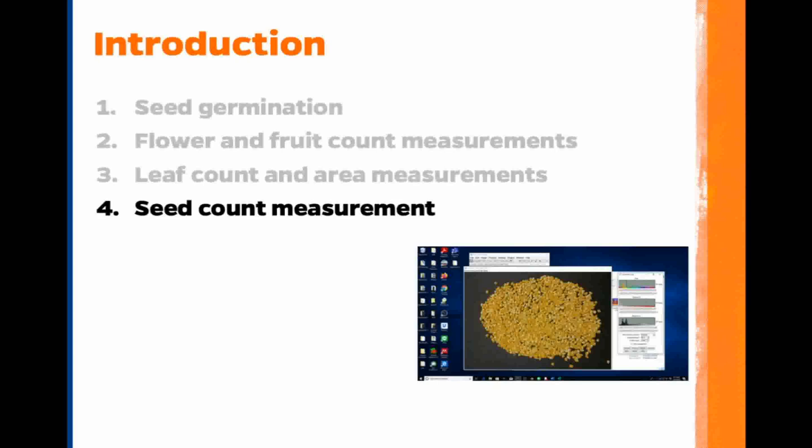This is the final video in a tutorial mini-series about counting with ImageJ. In this video, we will automatically count the number of corn seeds spread on a table.